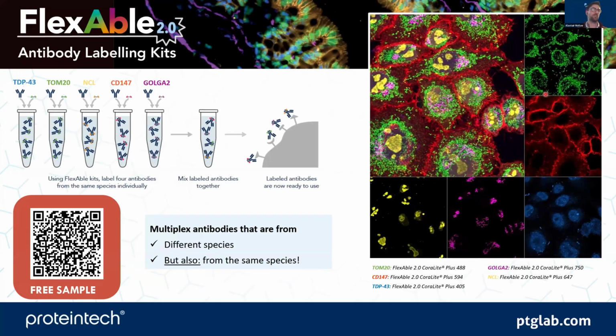So if you had, for example, 5 rabbit IgGs, you could label each of these with a different color. Once you've labeled these, you can mix them together and stain in one step without worrying about having to use secondary antibodies, which prevents that cross-reactivity. So I just wanted to highlight that for anyone who's doing immunofluorescence as well.